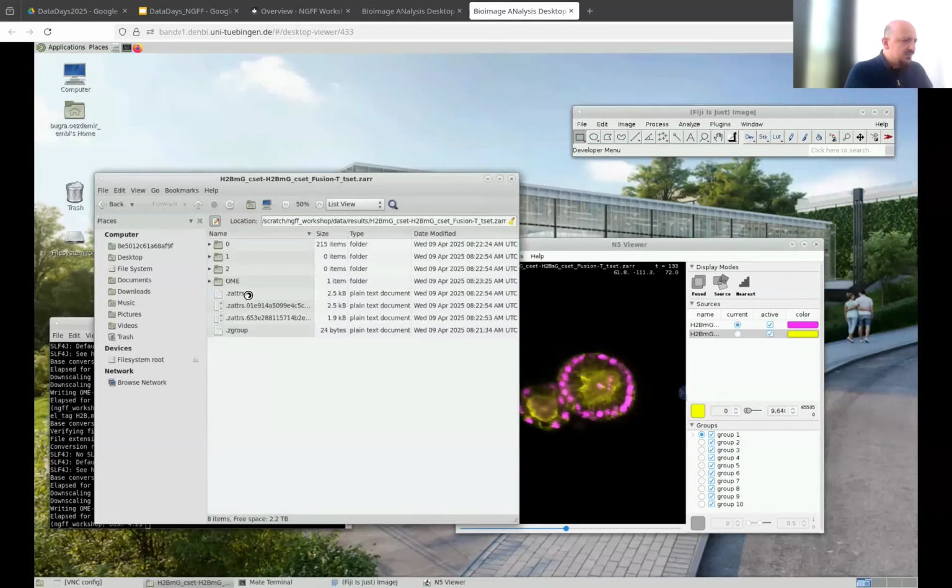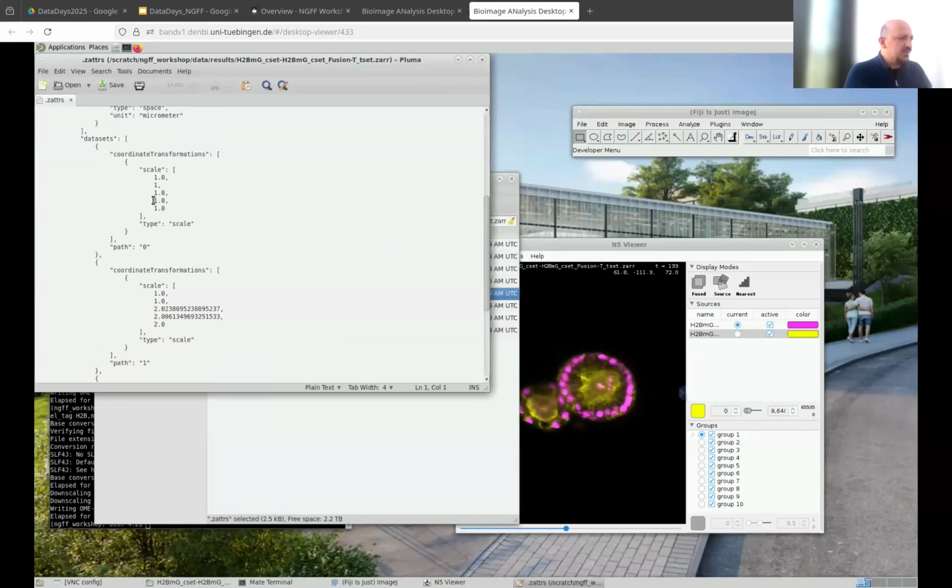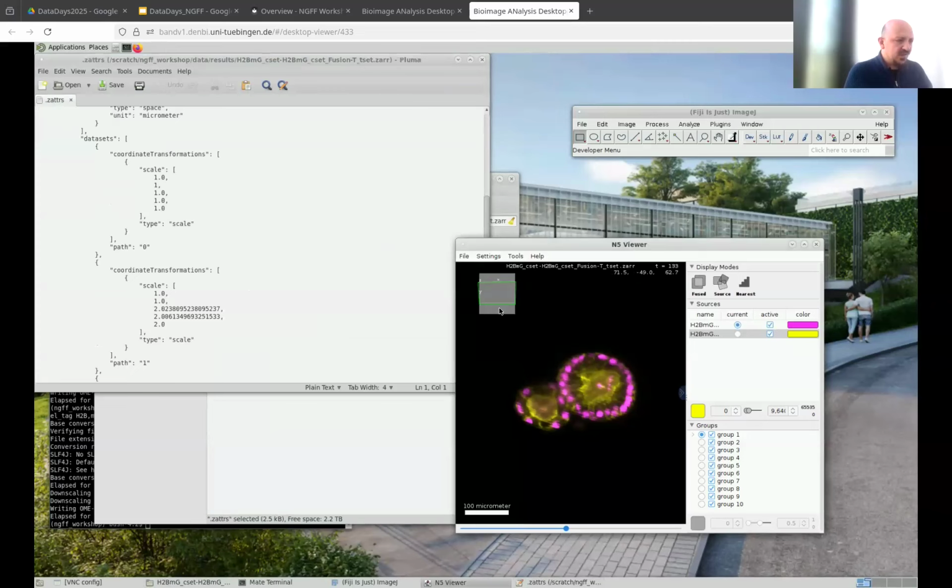If we see the metadata, I think the original TIFF files that we converted from apparently didn't have correct pixel scaling, so it just had the number 1, which is default. So it was also converted like this. That's why you see that the aspect ratio when you rotate seems a little bit odd.